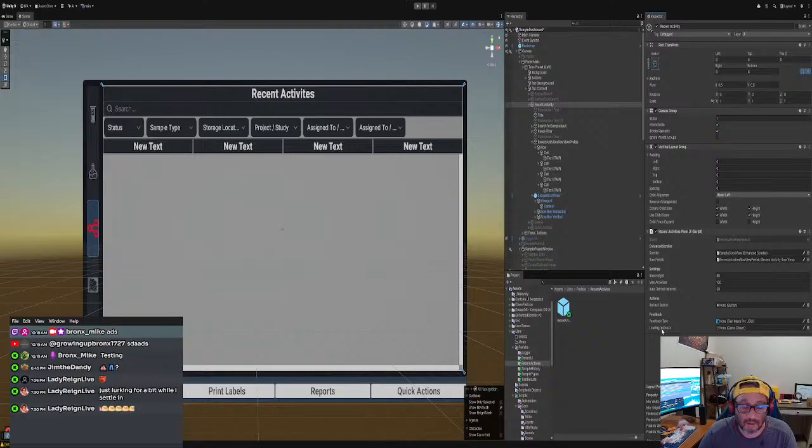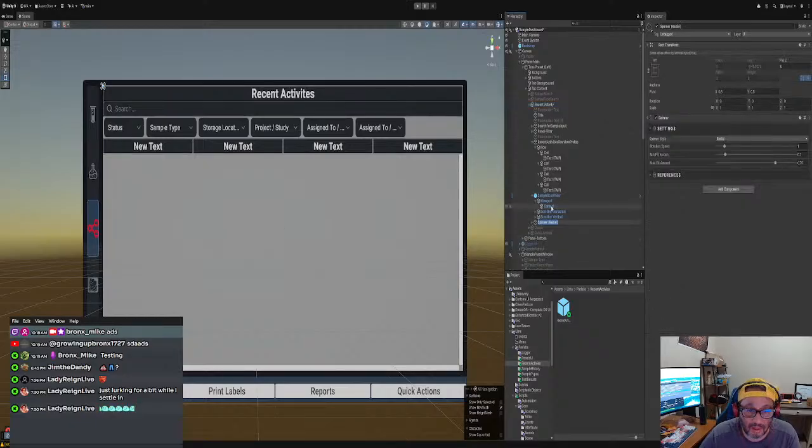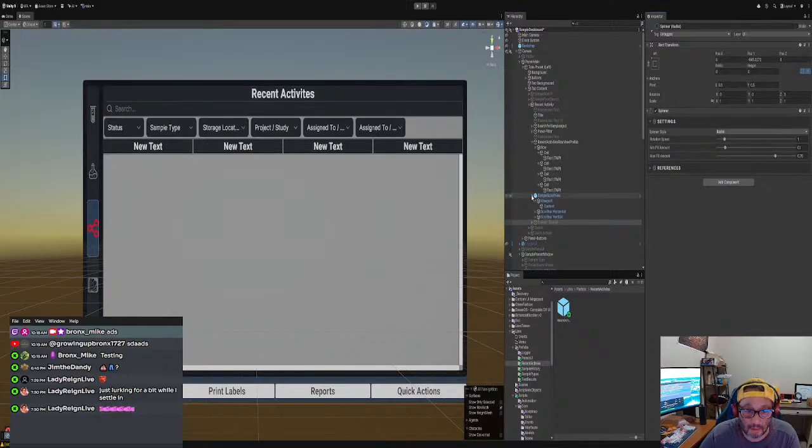That's fine. You may want to do a loading indicator, which is a good idea to do now so you don't forget. Let me see the indicator. Nope, don't have it. So we just add it here. Evo, spinner, radio. Turn that off for now. Am I correct?